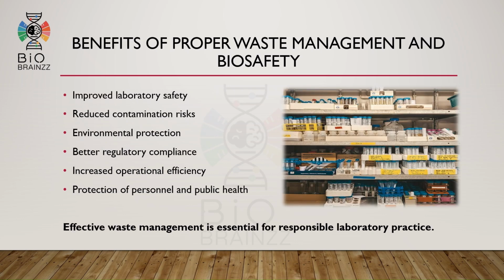Proper waste management and biosafety provide many important benefits. They improve laboratory safety, reduce contamination risk, protect the environment, and improve regulatory compliance. They also increase operational efficiency and protect both laboratory personnel and public health.